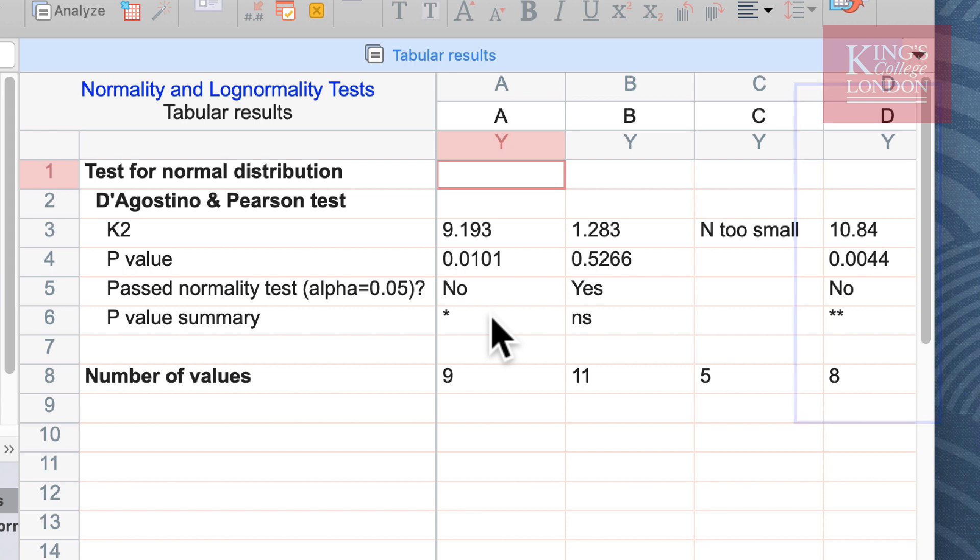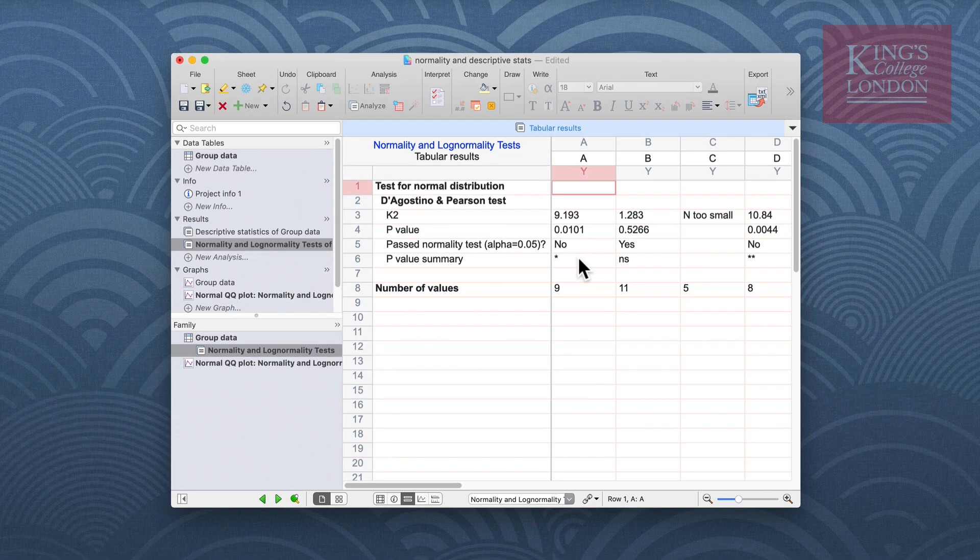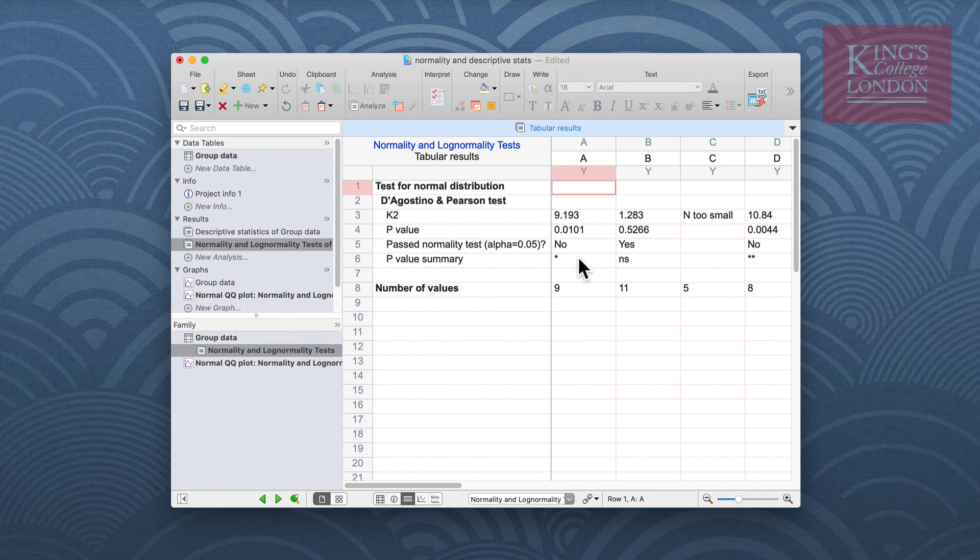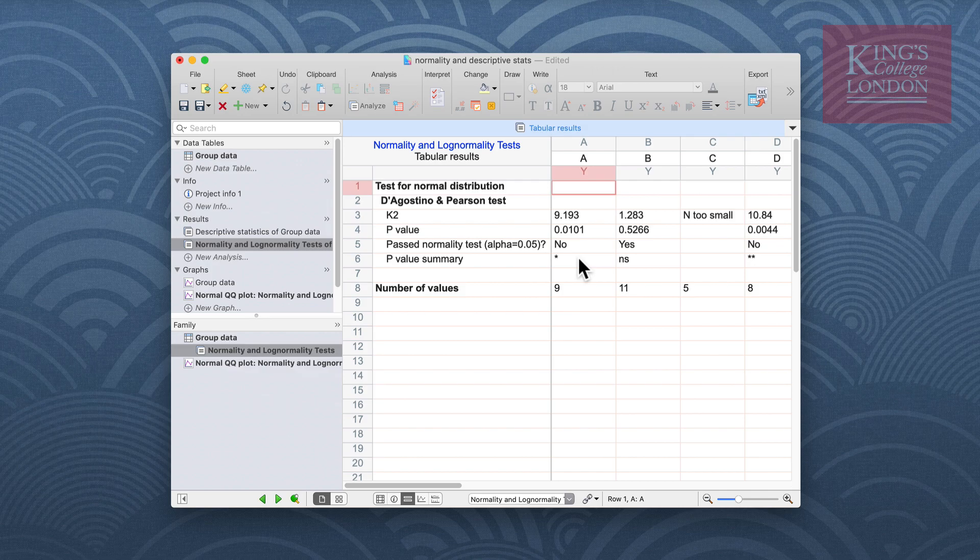So in general we can find out some very interesting information about our data sets without doing any statistical tests, just simply by using the descriptive statistics to show means, standard deviations and confidence intervals, and using a normality and lognormality test to check your data for normal distribution prior to doing any statistical analyses of your data.